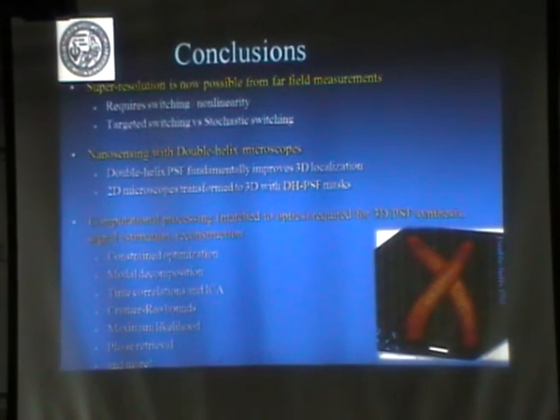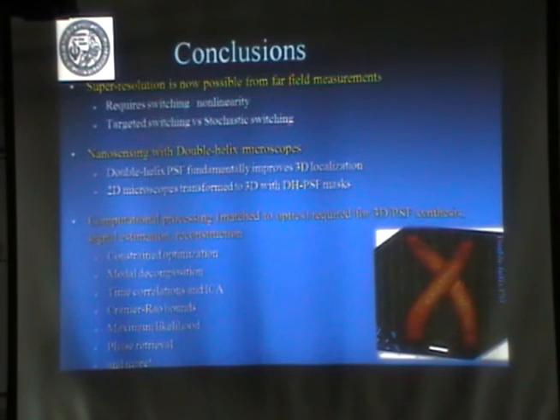And the follow-up is, is the double helix the optimal illumination geometry? Well, the double helix is not the illumination. The double helix is on the passive side of the microscope. The illumination is separate. Right. Now, is it optimal? No, it depends. So the key is this.